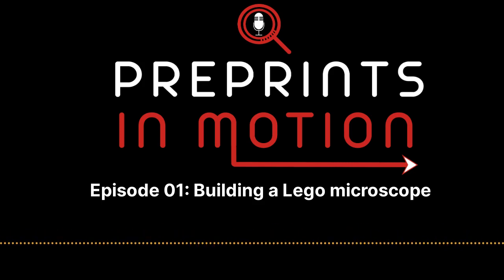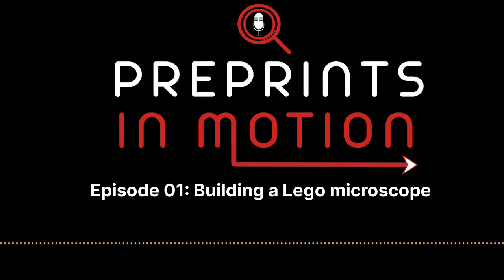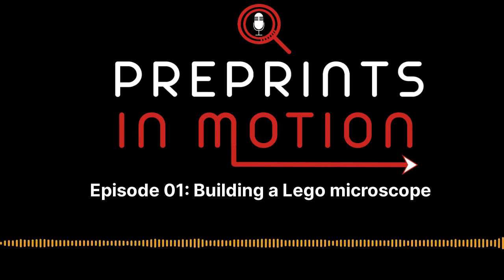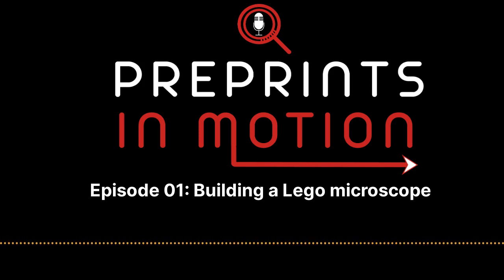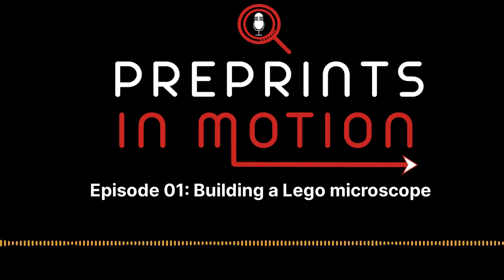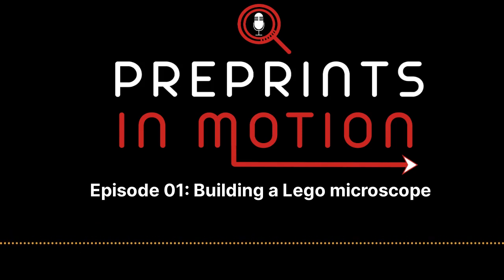So with me today, I have Dr. Bart Vos, who is a postdoc at the Institute of Cell Biology at the University of Munster. And we're going to be talking about a really cool preprint that I think is really appropriate for this podcast as our first episode, actually. And this is designing a high-resolution Lego-based microscope for an educational setting. Now, I guess the obvious question is why Lego?